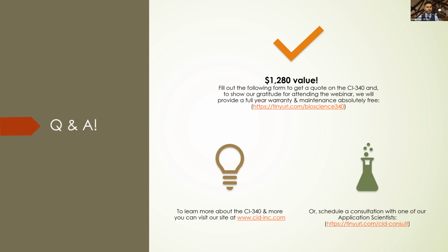The next question is, can photosynthesis be measured while the plant is growing, specifically microgreens, which are vegetable seedlings? Yes, you can measure. It measures low enough that you can pick up transpiration and photosynthesis rates in very small amounts. We would definitely suggest using a smaller chamber, of course, just so that you keep the atmosphere as microclimate as possible.